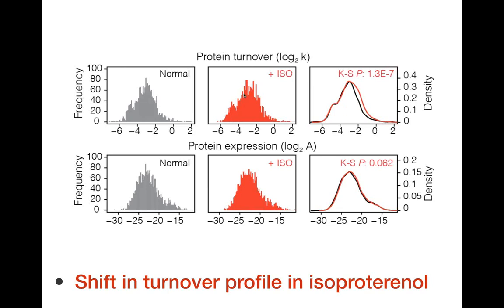Okay, thank you. Sorry, I probably wasn't making much sense. No, that's okay. I was interested in what proteins you're actually looking at here, so thanks. So in this analysis, we recombined all the fractions after we ran the experiments individually.